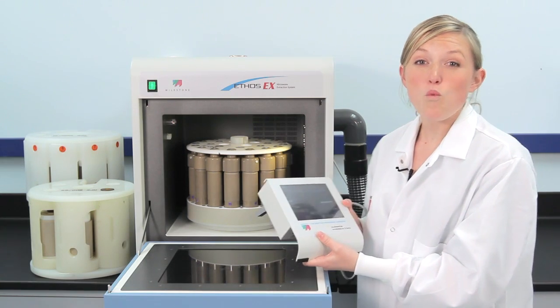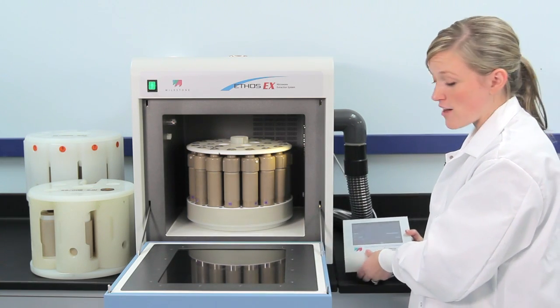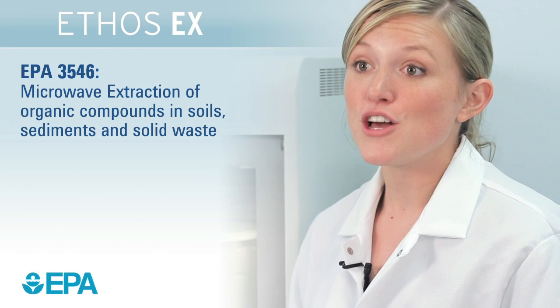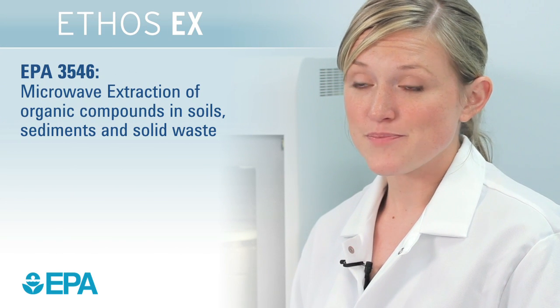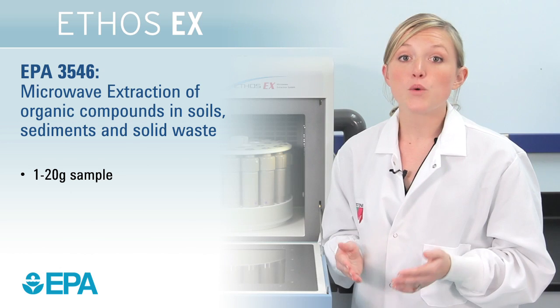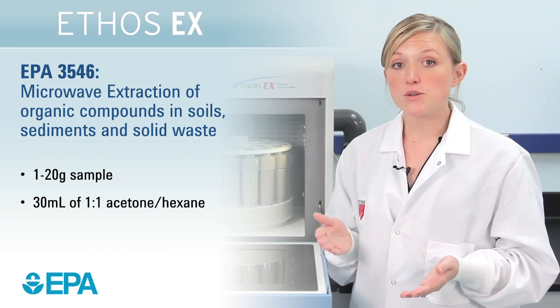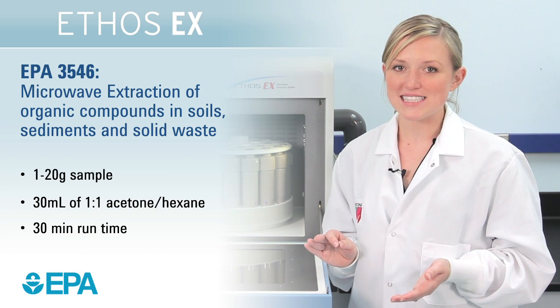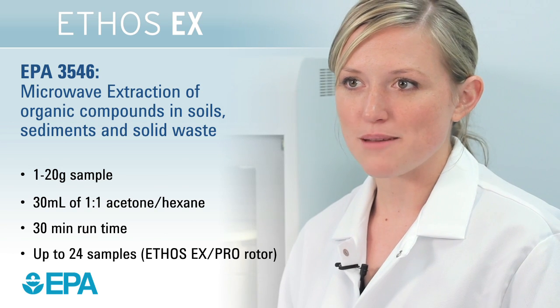You can also connect a balance and directly input sample weights and store them with the run. Microwave extraction of a wide range of organic compounds from soils, sediments, and solid waste is defined by EPA method 3546. One to 20 grams of sample is extracted with 30 mL of a one-to-one acetone-hexane mixture. Run time is 30 minutes and up to 24 samples can be run simultaneously.